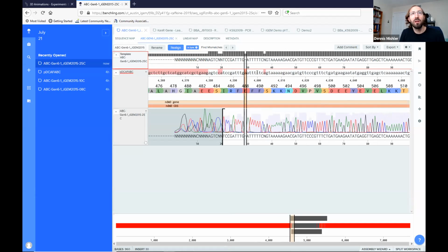We have a red here and we have a red here. And so this is where understanding the chromatogram is really important. Are these mutations, something's wrong, or is this just an artifact of the sequencing? Was there an error, or was the sequencing result a little unclear? And so we had to figure that out. This one's easier to deal with, so we're going to look at this one here first.